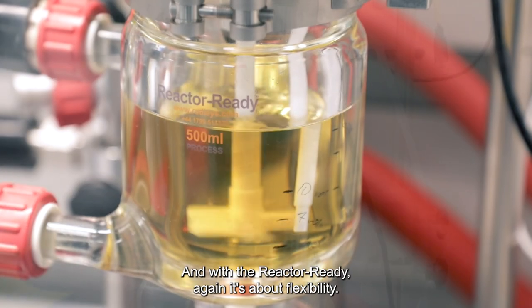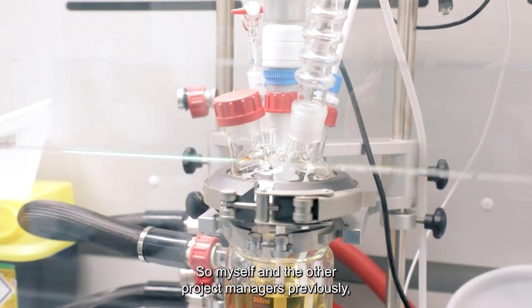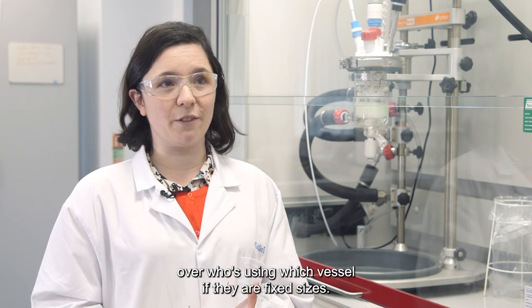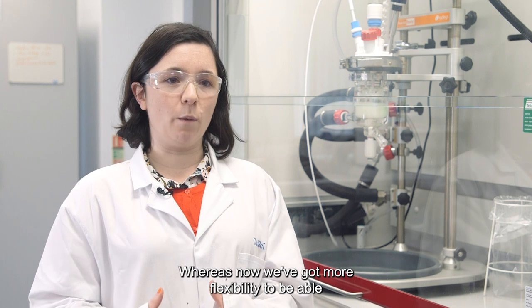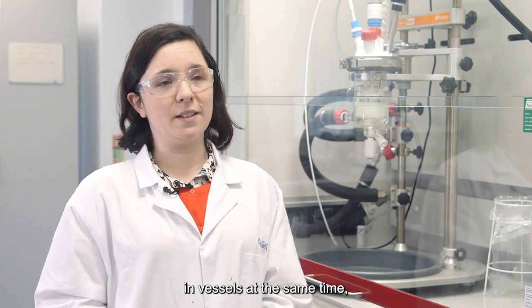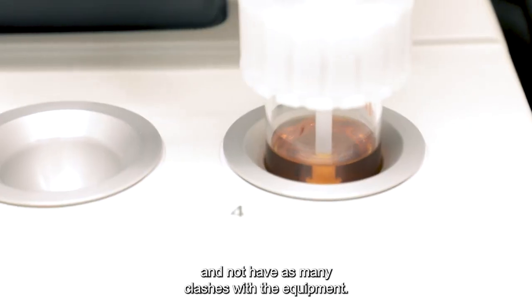And with the Reactor Ready, again it's about flexibility. Myself and the other project managers previously were finding we had to do a lot of planning over who's using which vessel if they are fixed sizes. Whereas now we've got more flexibility to be able to have different projects running in vessels at the same time and not have as many clashes with the equipment.